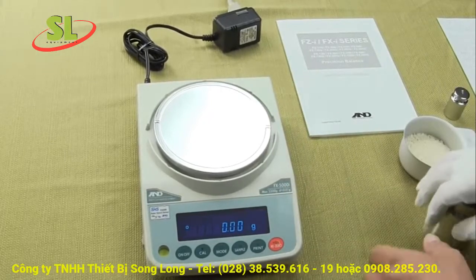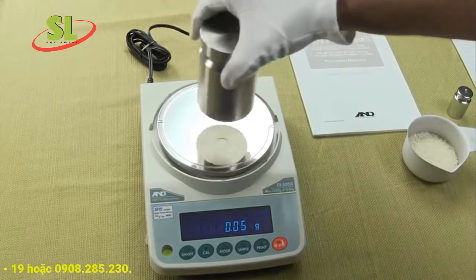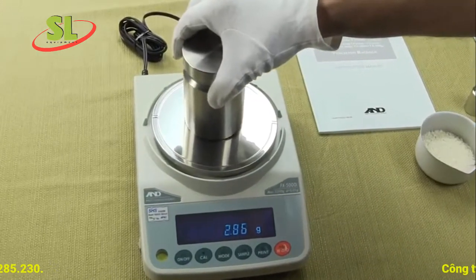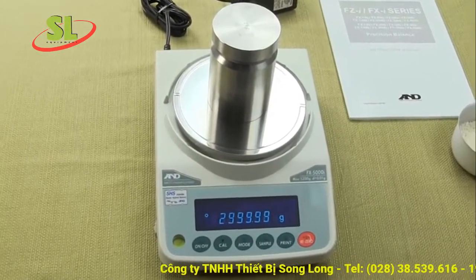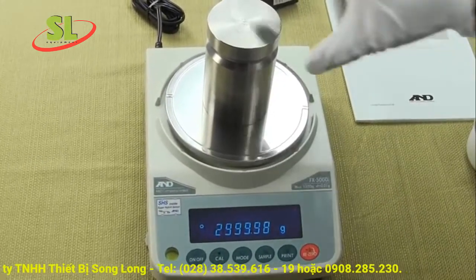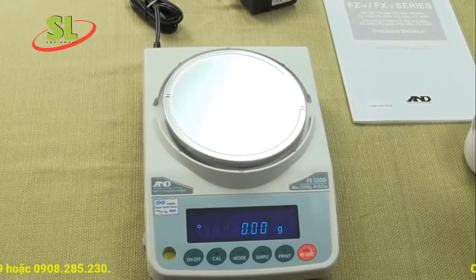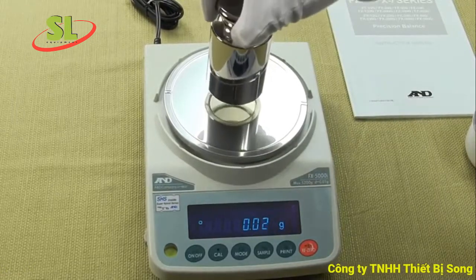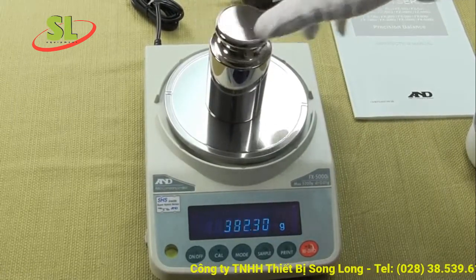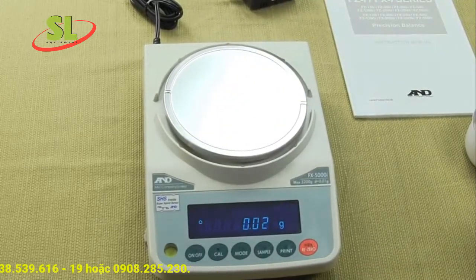The FX series balance has external calibration only, and the calibration weights are optional — you must purchase them separately. If you visit calibrationweight.com we have a large selection. The FXZ series, by contrast, has internal calibration. We'll go through the calibration procedure on this balance in a moment.